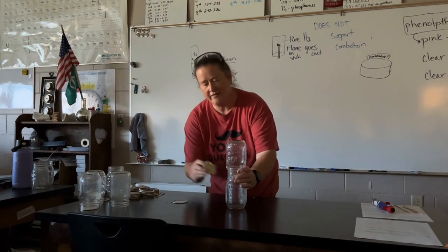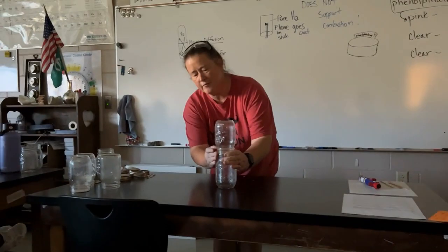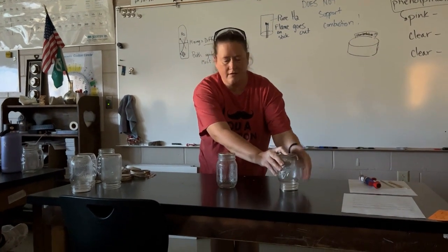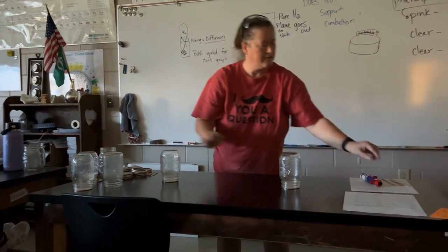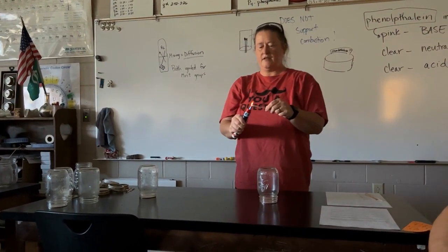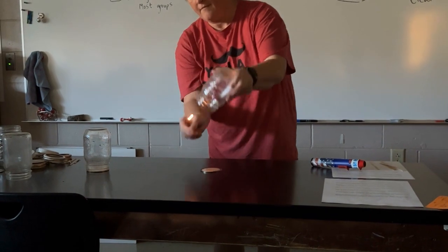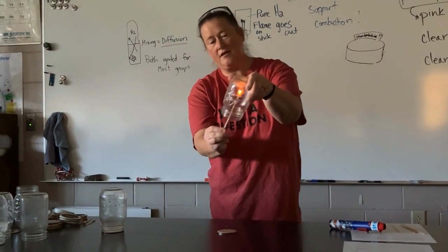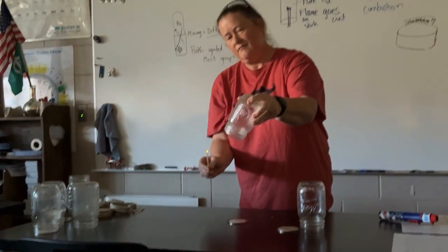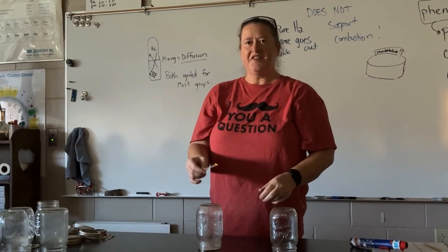Thank you. And we have another set that we are testing from experiment 4, properties of hydrogen, bottle number 4. In the last video, it wasn't nearly as explosive as it typically is. Let's see what happens with this one. Yeah, it stayed lit. I think that was a little bit more explosive than the last one. Let's try this. Ooh, that was a good one. Alrighty. Done and done. Thank you.